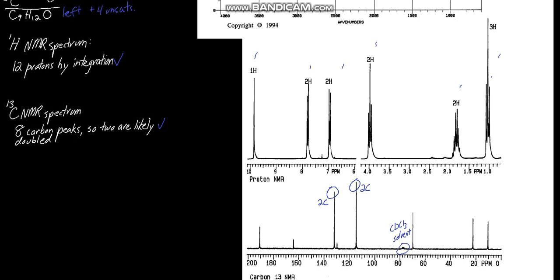Let's look at the proton NMR and let's look at the methyl group here. Why do I know it's a methyl group? Not many other things can integrate for 3 hydrogens. This methyl group is split into a triplet, which indicates that next to that methyl group is a carbon bearing 2 hydrogens. You can look at it as if these 3 hydrogens create 1 signal split 2 additional times to give you a triplet, and that's exactly what we're seeing. So that's the triplet at 1.0 ppm, and these 2 hydrogens are split 3 times, so this is going to be a highly split signal.